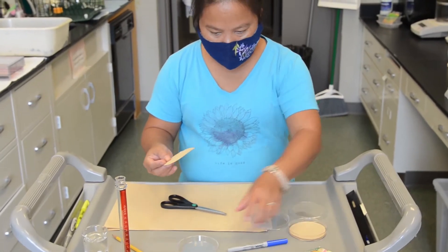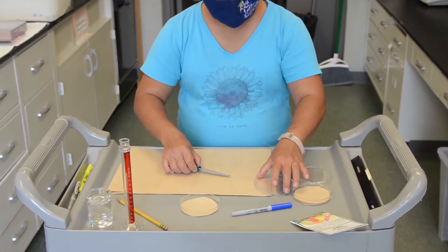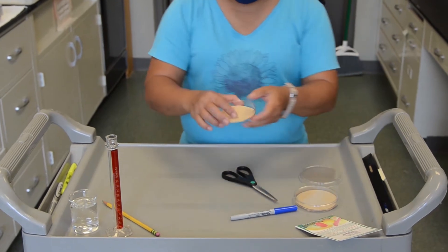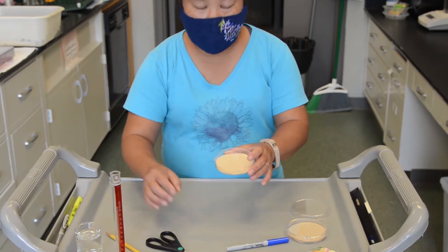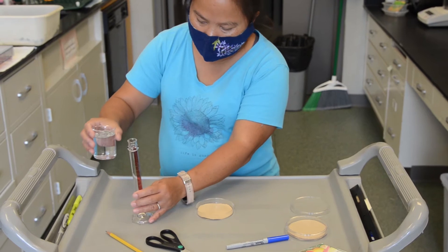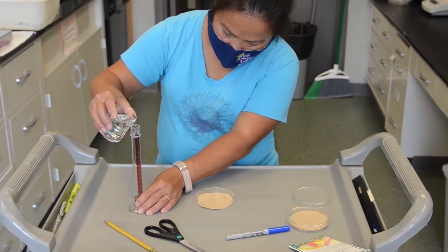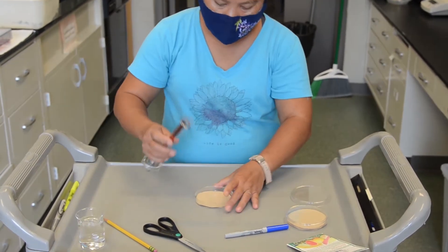And then after you get that, you slightly insert this into your petri dish. The next step is for you to add water in here. And from my experience, you can add about 4 to 5 ml. So I'm going to do 5 ml here, and then slightly pour it.